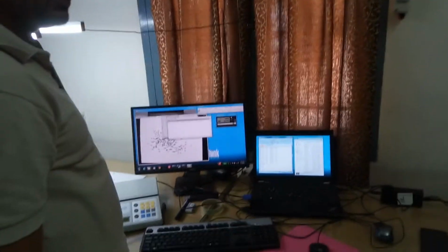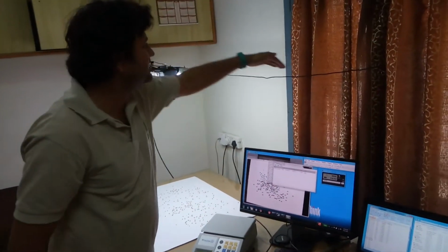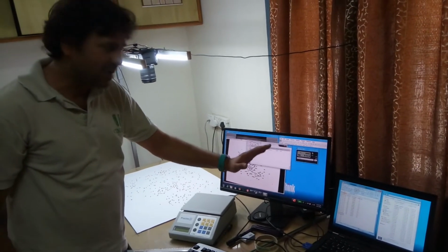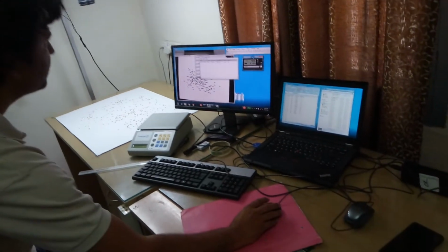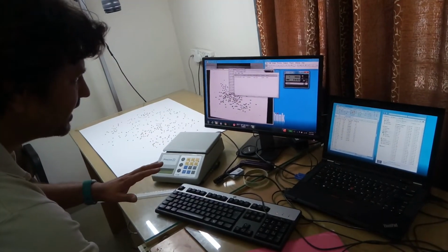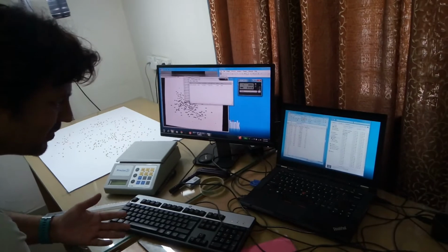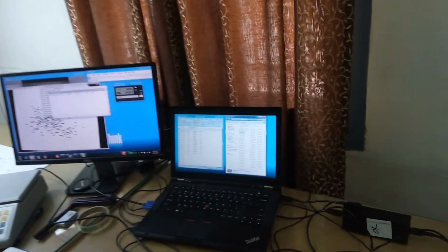This camera is connected to the computer through this USB cable, and now I can operate the camera with the computer. I have set it at a manual focus so that it won't drain too much battery and won't disturb too much. Just click here. Now you heard the sound. The image is automatically transferred to the computer. I link the folder, the image is saved.